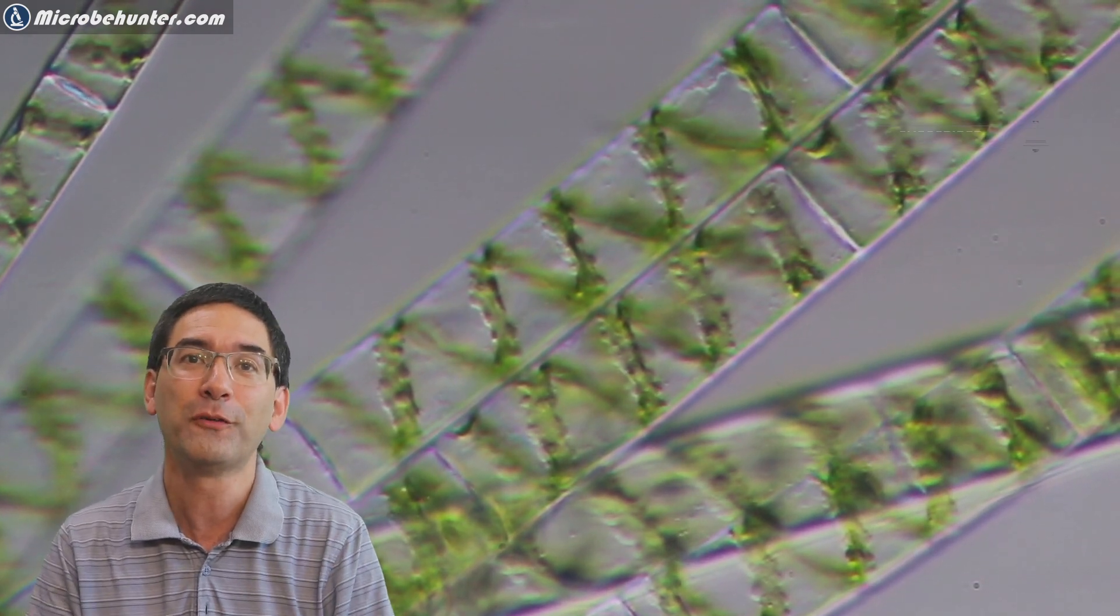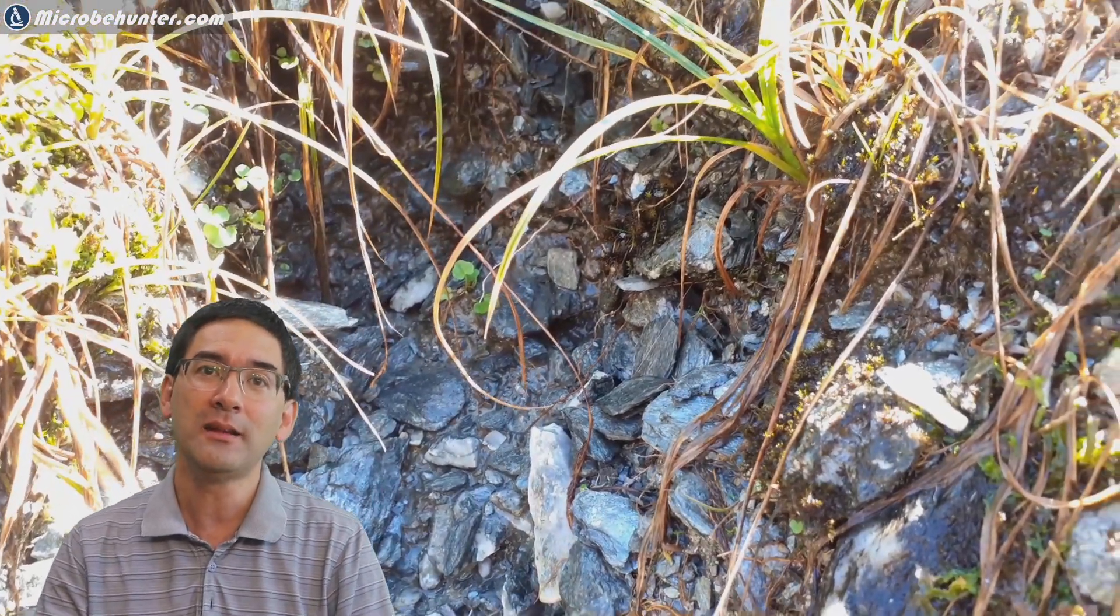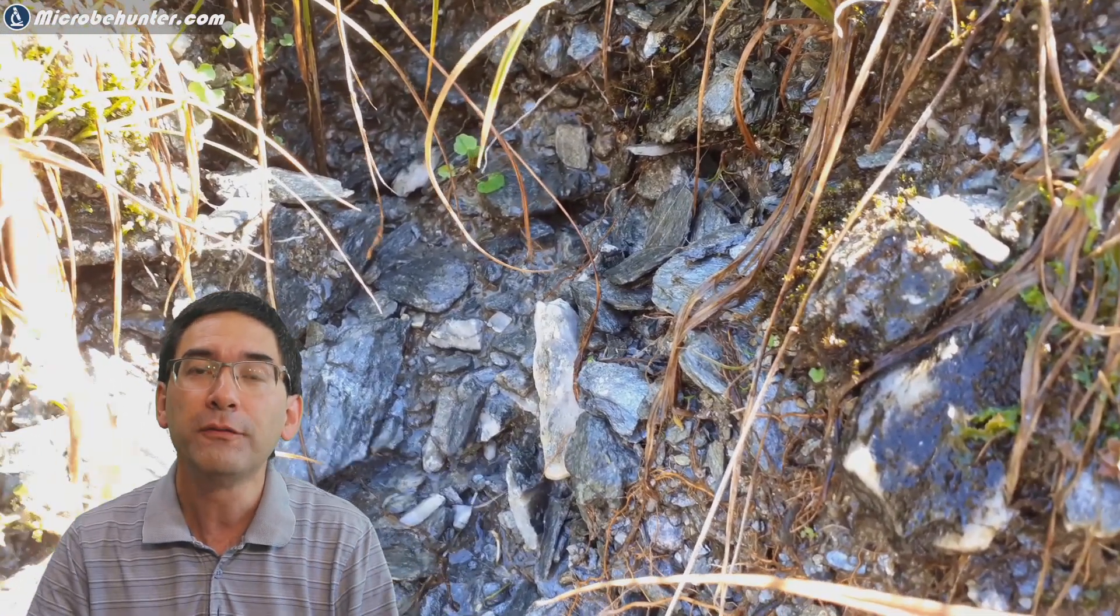But these algae here, these are freshwater algae. Where did I get them from? Well I spent a couple of days in the mountains and of course there are a lot of water places there. I saw water dripping out of the side of the rocks and collecting because it rained a few days ago.